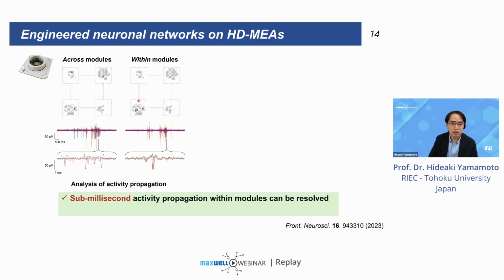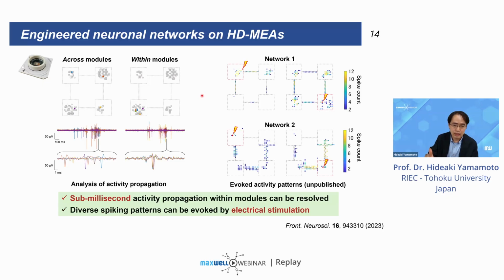And another important feature of the MEAs is that, as Marie mentioned, the electrodes can be configured to stimulate these neurons. And taking advantage of this feature, we can see that diverse activity patterns can be evoked by stimulating different sites of individual networks, leading us to consider using these systems for reservoir computing.